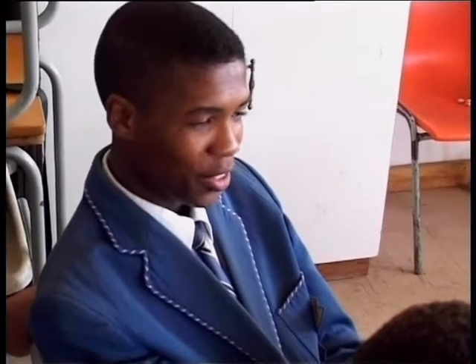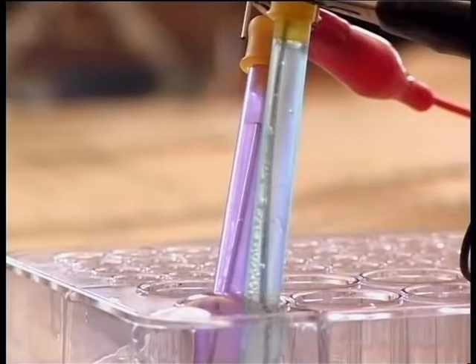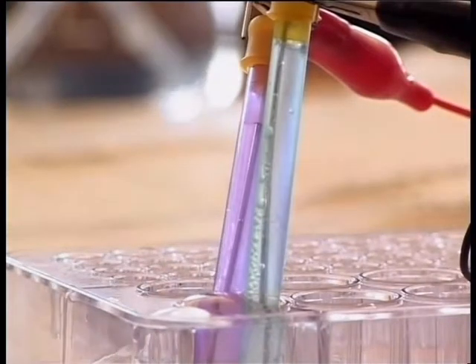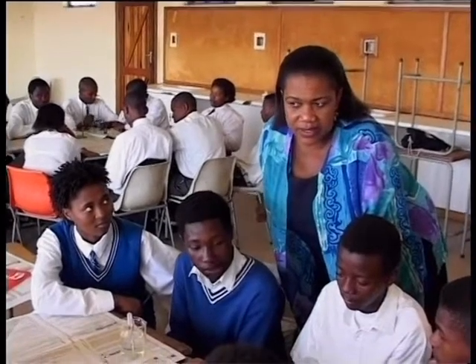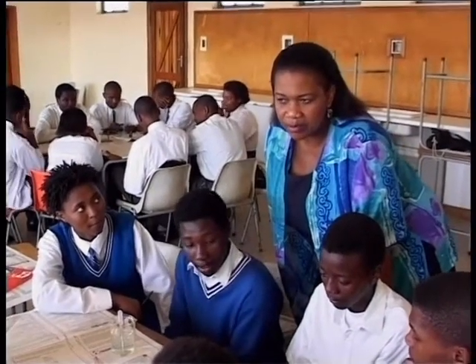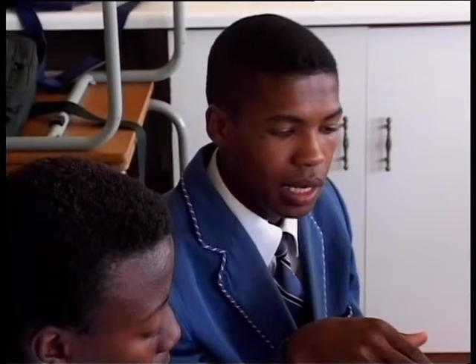Inside the two electrodes, they are filled with water, and one of the electrodes has more bubbles. You said you have water in the form of ions. So now, if you have gases, which gases do you think will be formed? There is a hydrogen gas and oxygen gas. Which one has been formed by a gain of electrons? You are saying there's a hydrogen gas and an oxygen gas, and which one has been formed by?